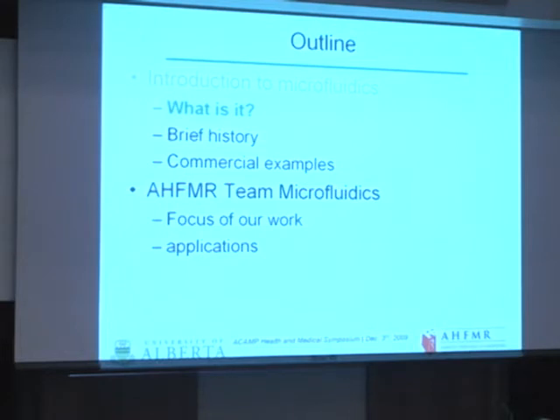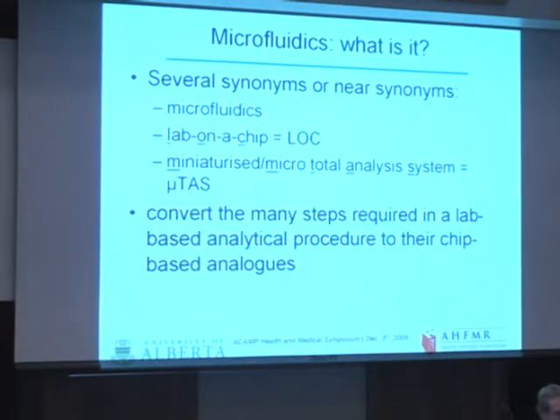So, microfluidics, what is it? There are a number of terms that are used to describe it that are more or less synonymous: lab on a chip, LOC, miniaturized total or micro total analysis systems.